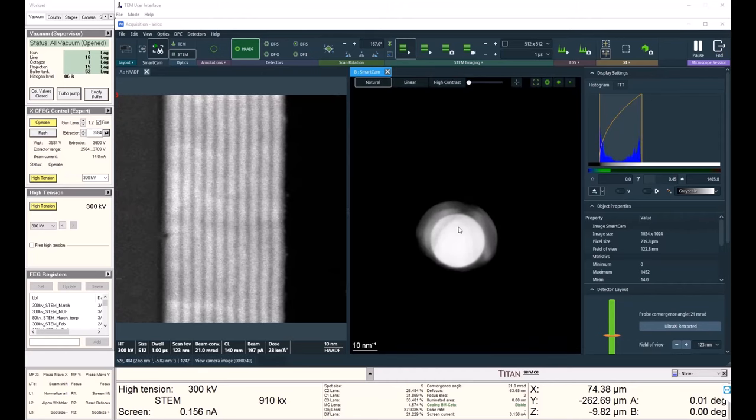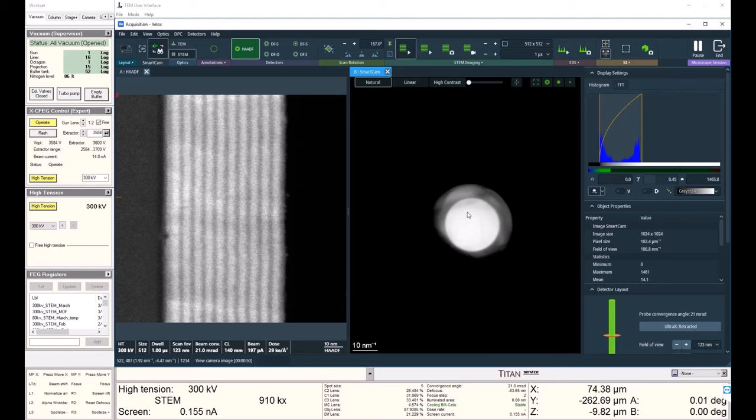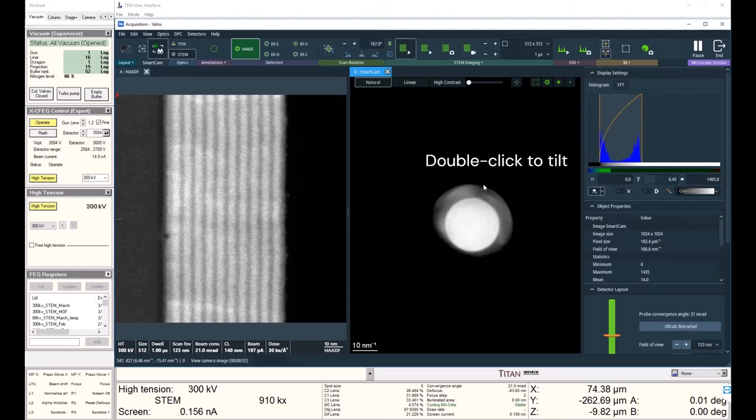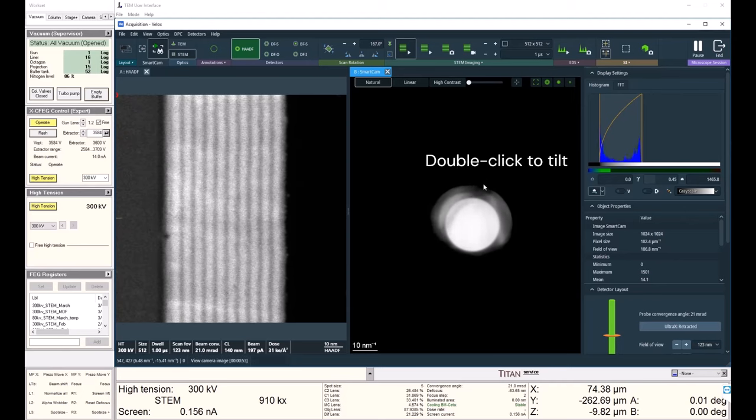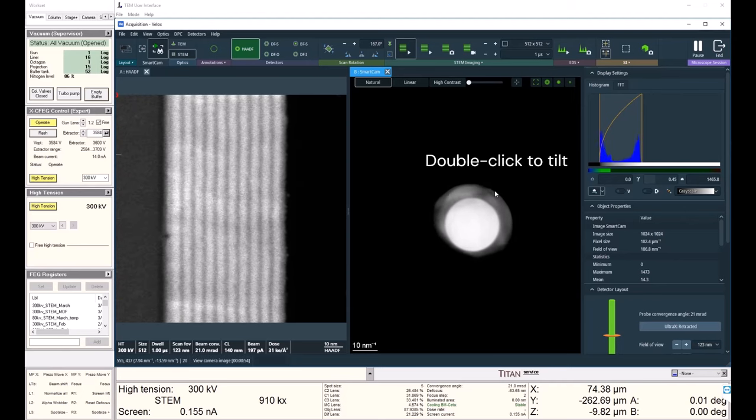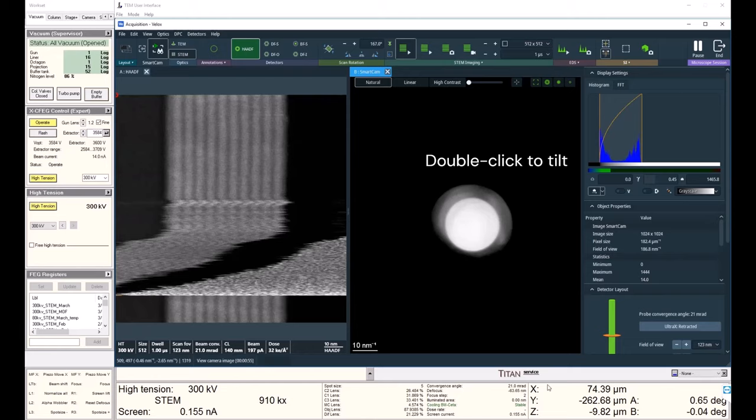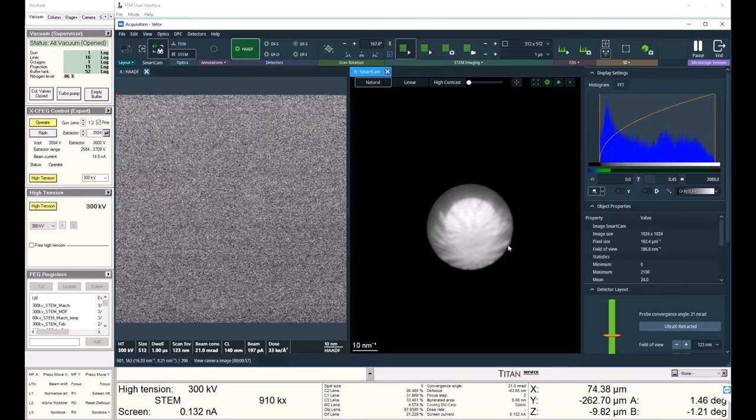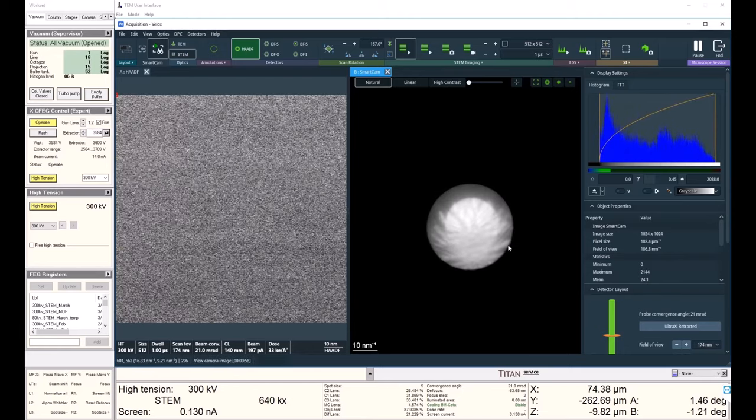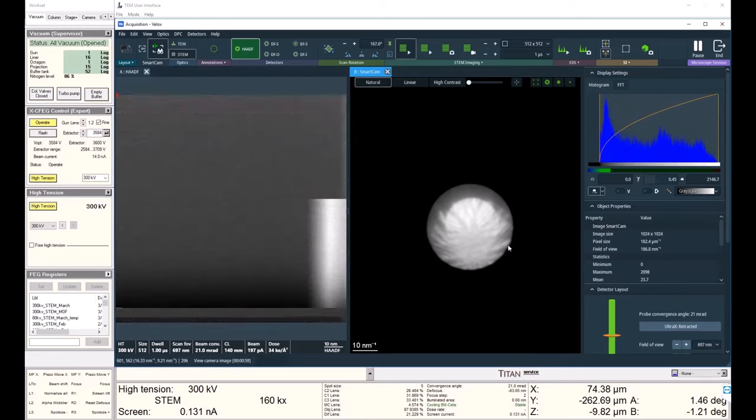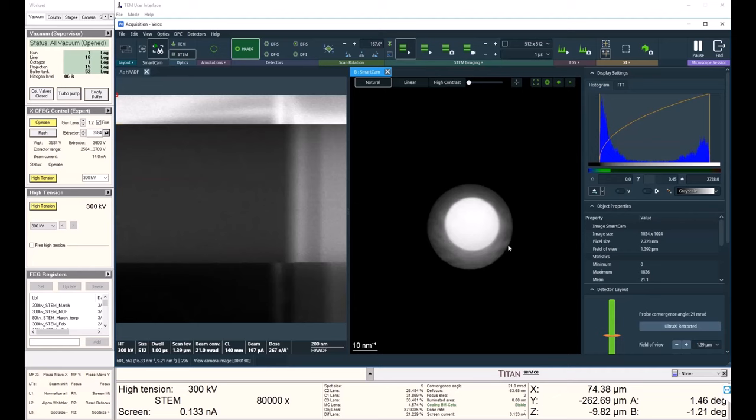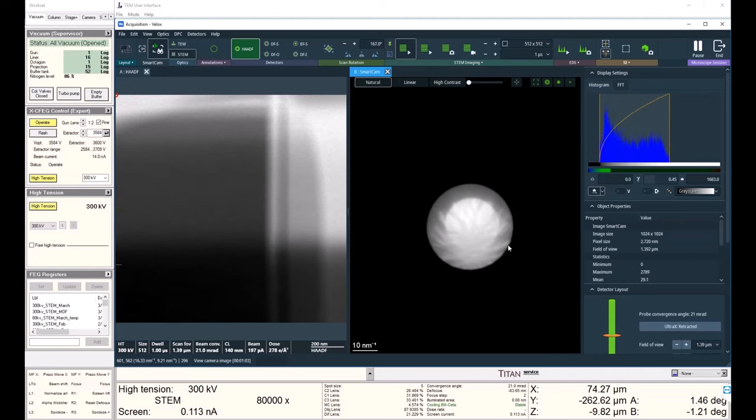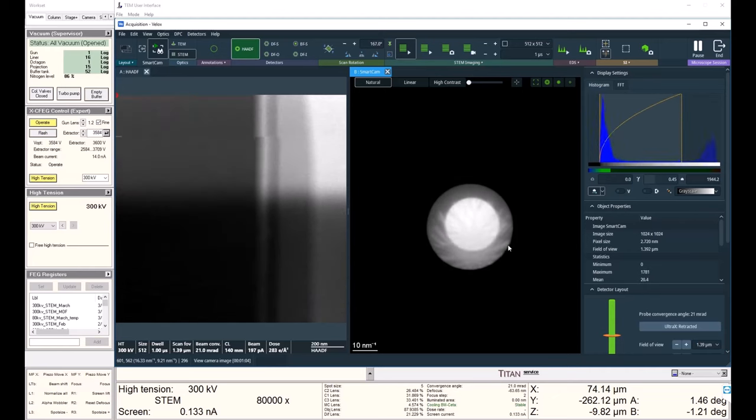So to get on the zone axis I'm simply going to double left-click where I think the zone axis is, and the stage is going to tilt the alpha and beta. Then I'll go to a lower mag to find my area of interest again because I did tilt in the beta, and I'll also need to adjust my Z height a little bit.